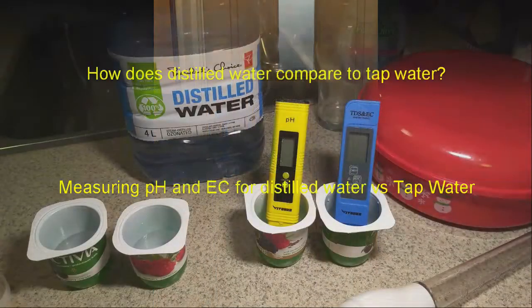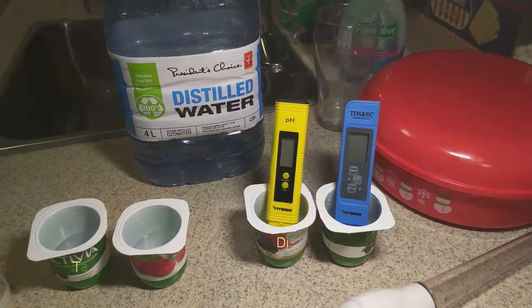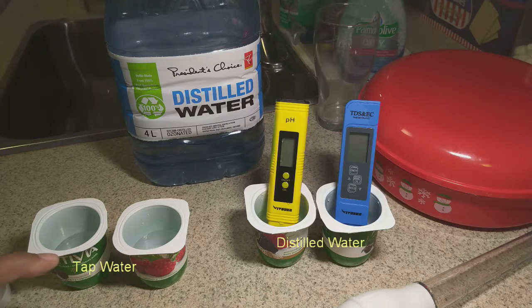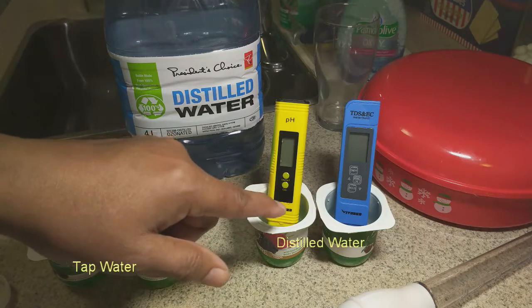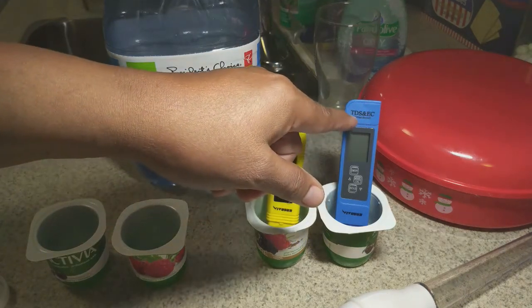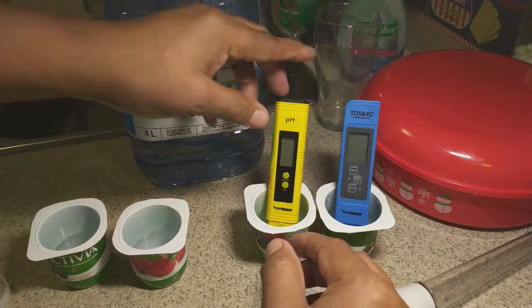The question is: how does distilled water compare to tap water? I'm going to show the measurements for distilled water compared to tap water. I have tap water in these two containers here and distilled water in these two here. We're going to measure the distilled water first, then transfer the pH and EC meter over to the tap water.